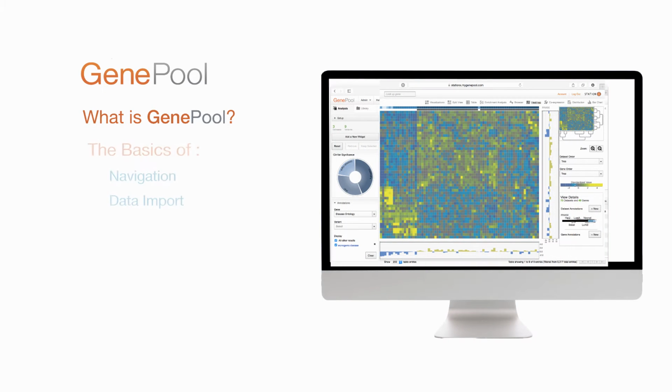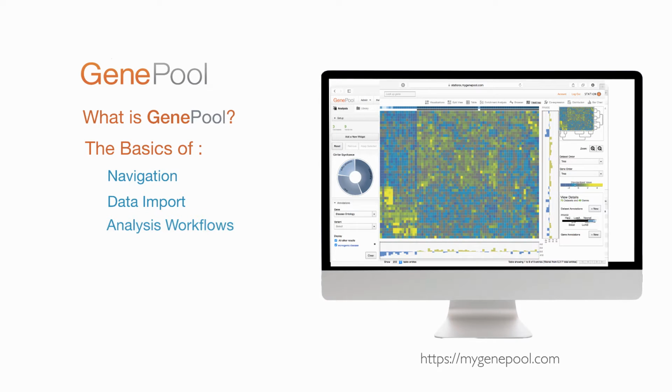In the video, I'll explain what GenePool is and run over the basics of navigation and data import, and then I'll demonstrate some analysis workflows that should get you up and running quickly. Once you've watched the video and have logged into your own account on GenePool, you'll find plenty of documentation in our help portal that describes GenePool's features in more detail.